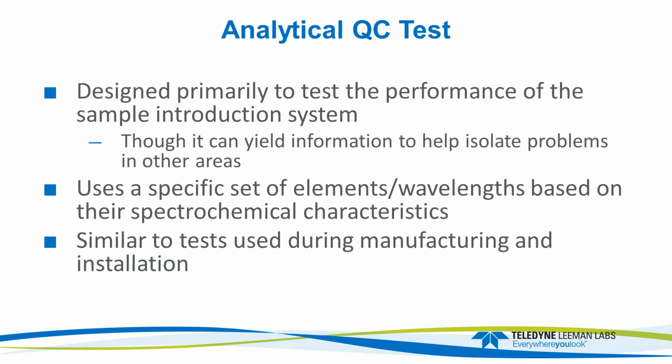Okay. So the analytical QC test is really designed to test the performance of the sample introduction system, though it can help other problems too.